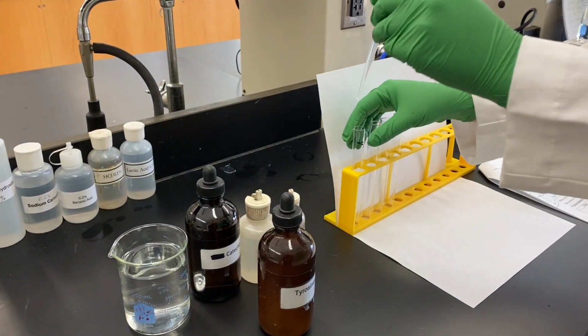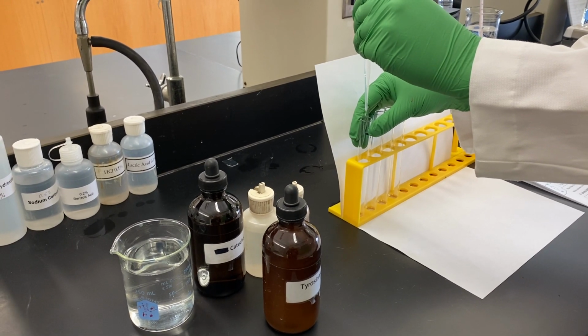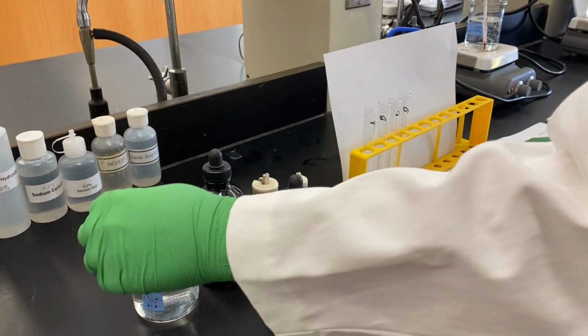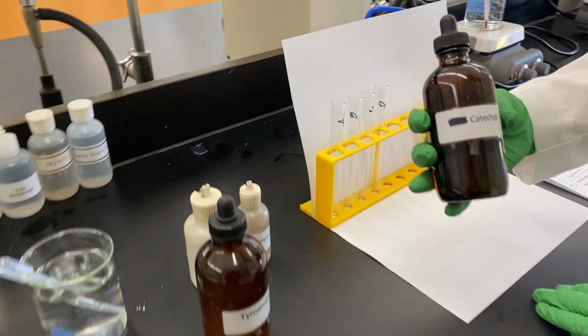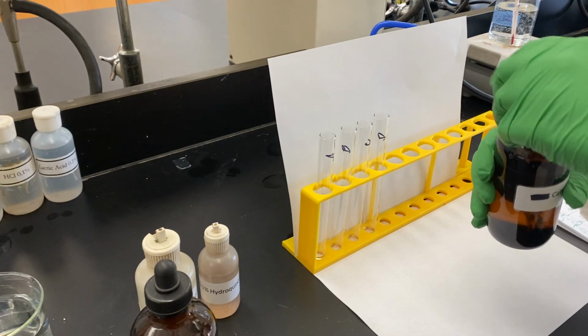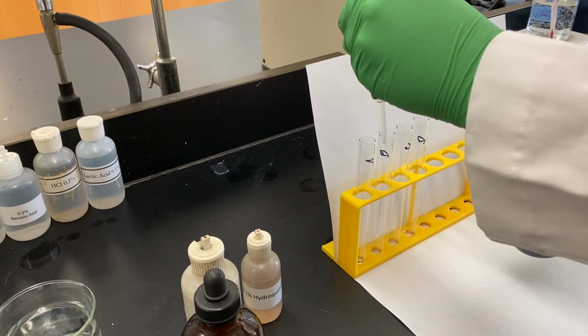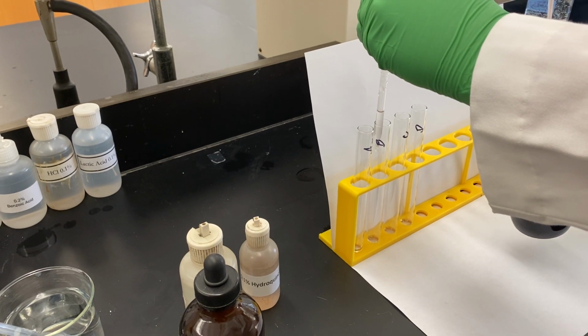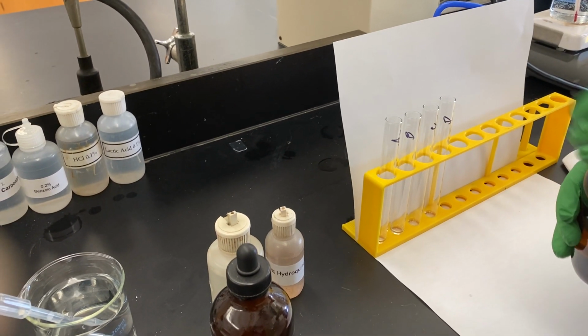Test tube A is just going to be water. 15 drops. In B, catechol, we will be using 1 potential substrate. We'll look at its structure in just a little bit. About 15 drops. Catechol.